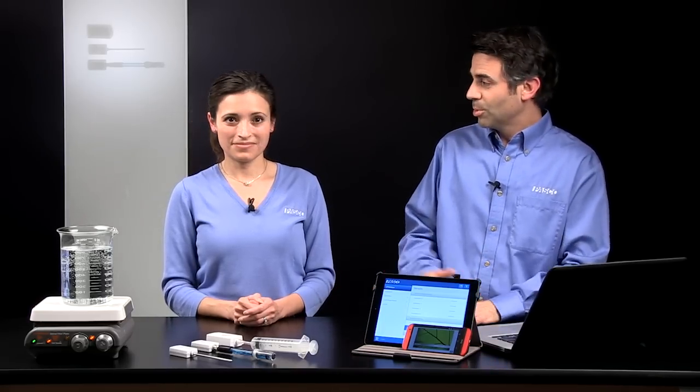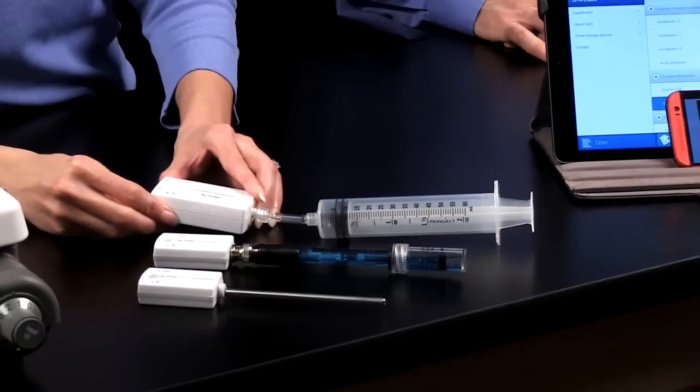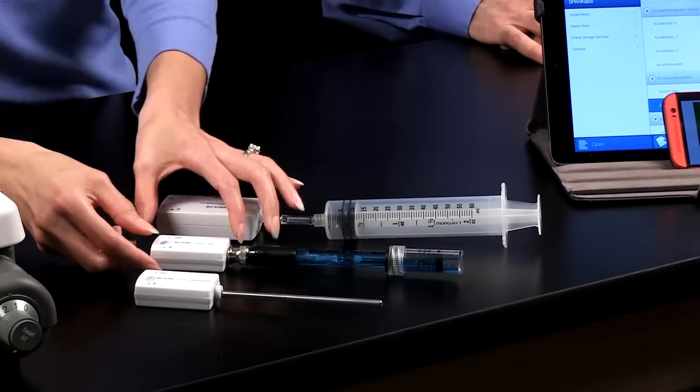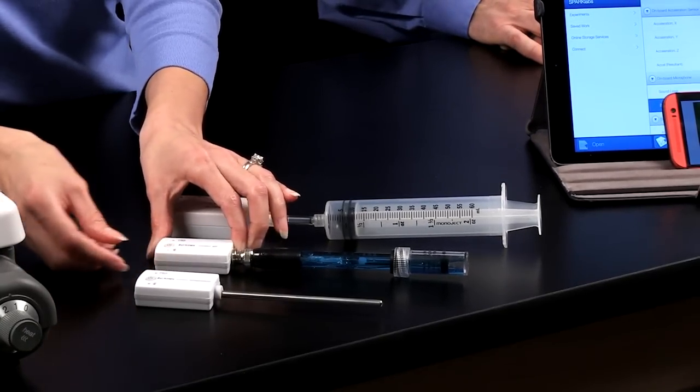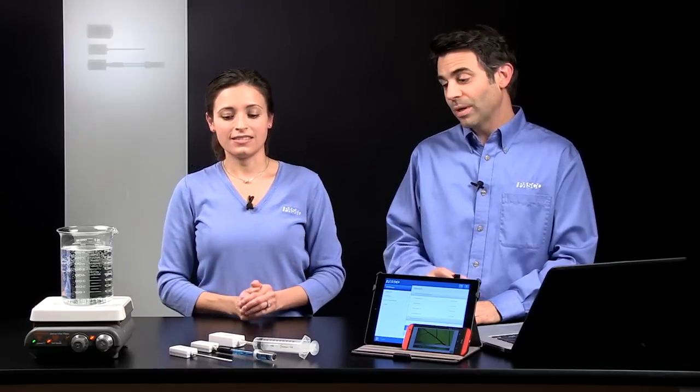So to connect, the first thing we need to do is turn them on. So I'm just going to hold the power button down for a second until the red Bluetooth light turns on. And that red light means that it's broadcasting a Bluetooth signal.